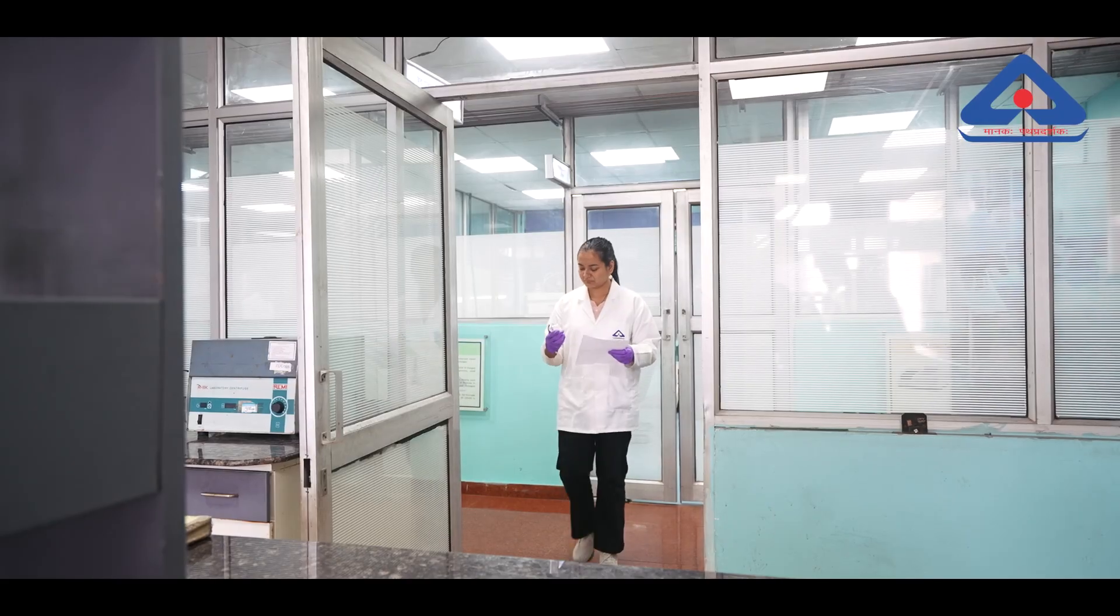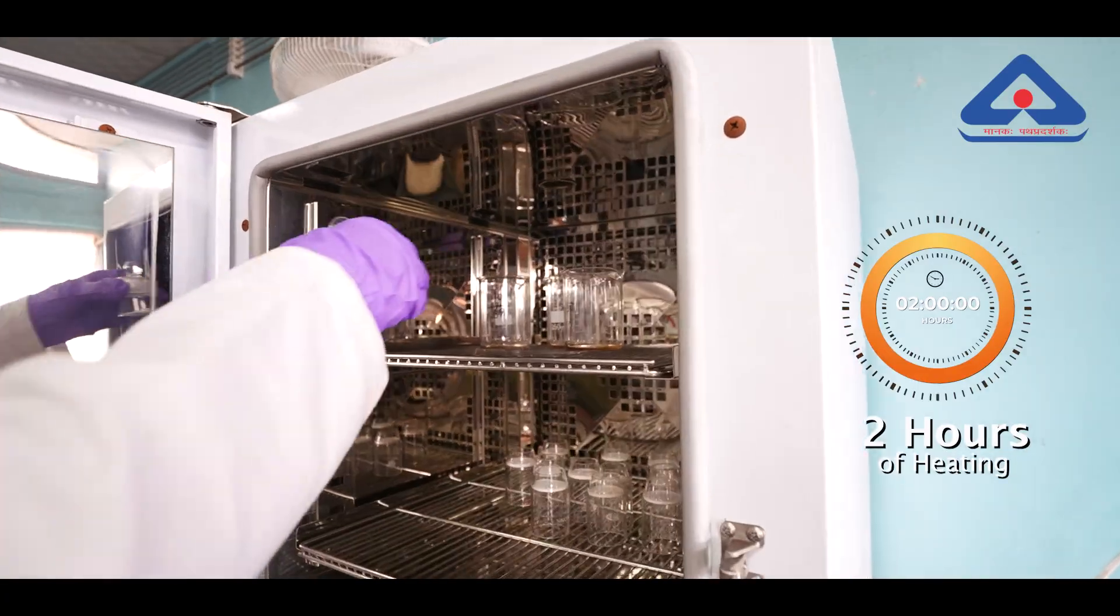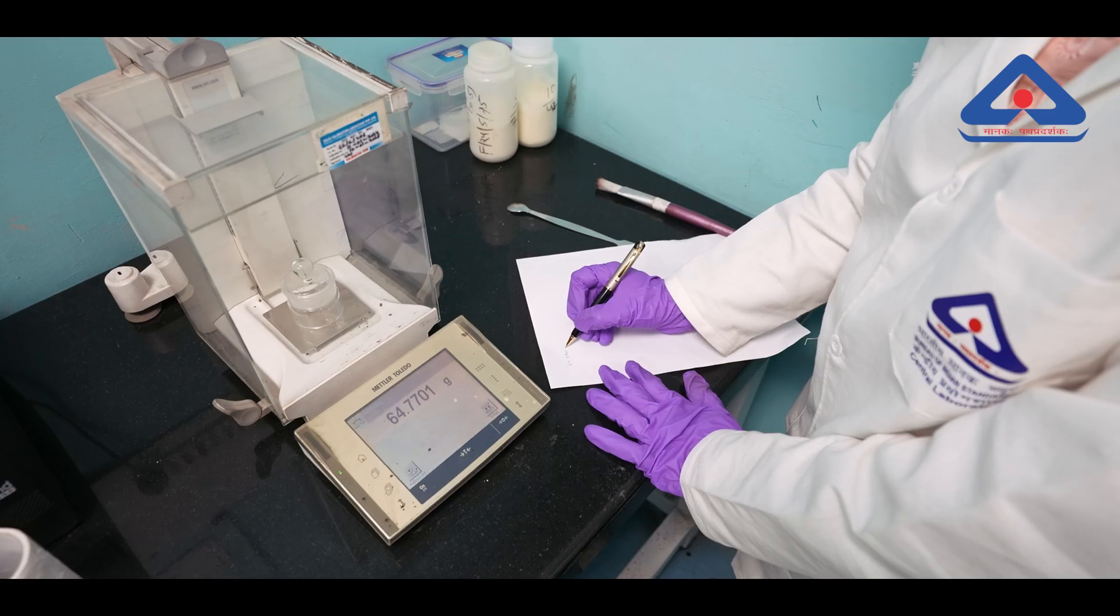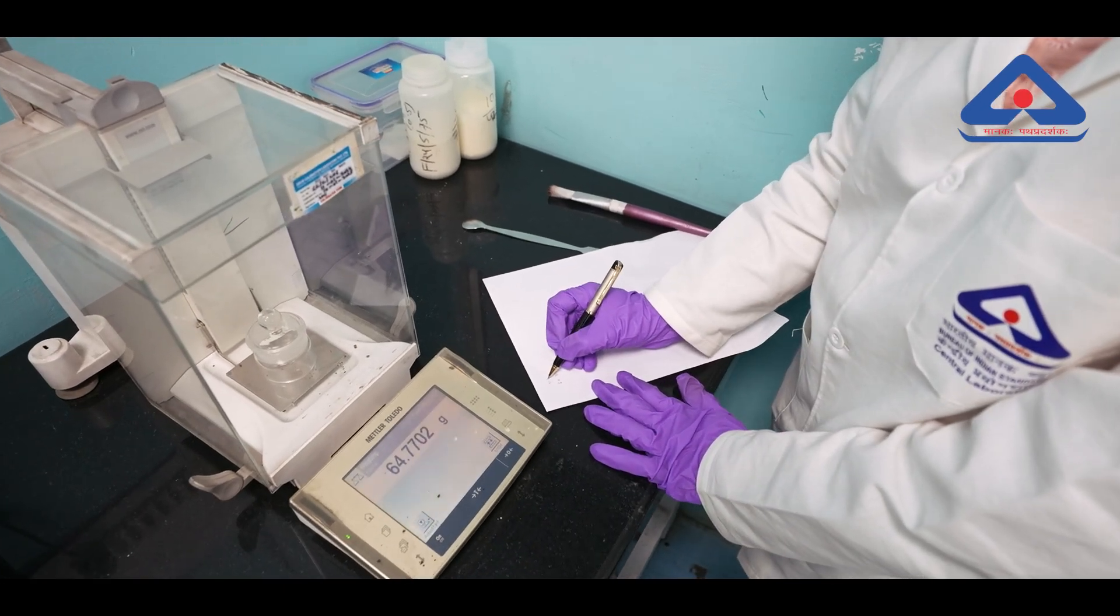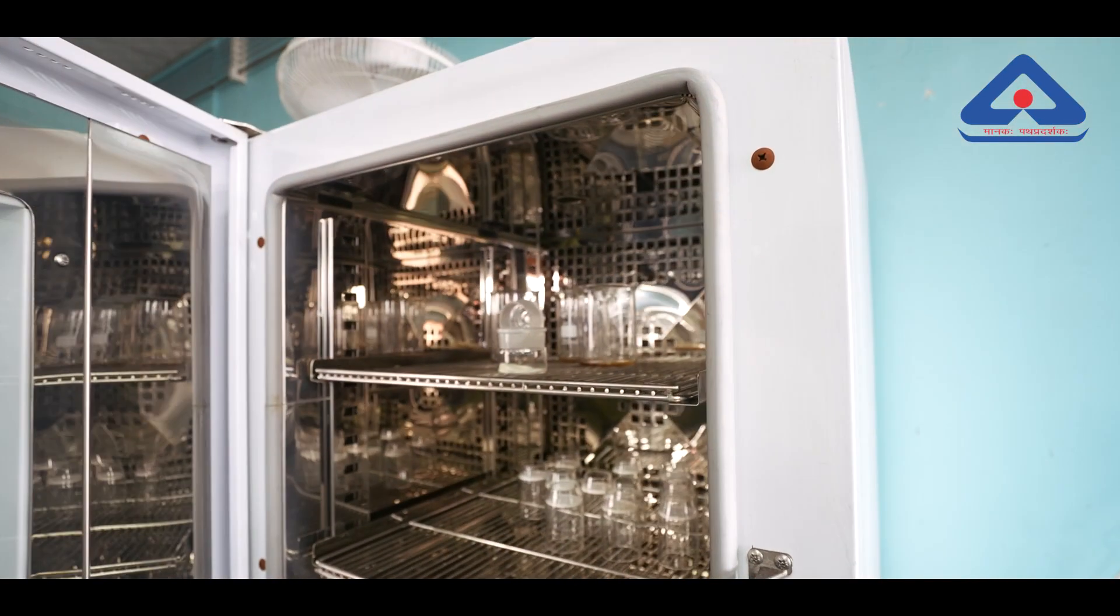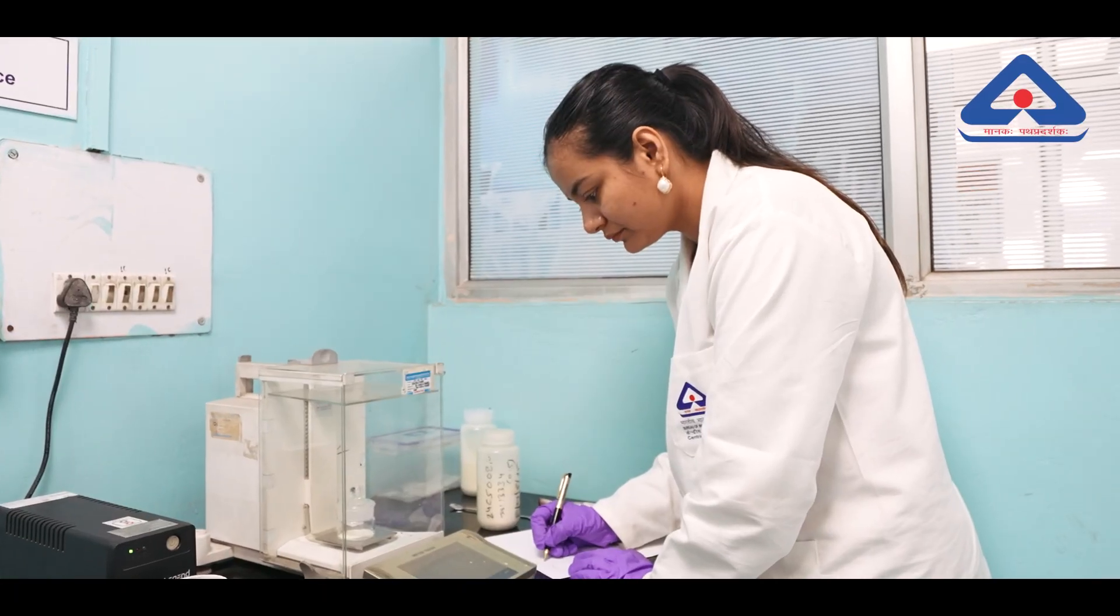Sample is dried in an oven at 102 degrees Celsius. The initial weight of the sample is taken and after drying final weight is taken. The difference in mass tells about the moisture in a sample. Moisture content checks water level which must be low to keep the powder stable over time.